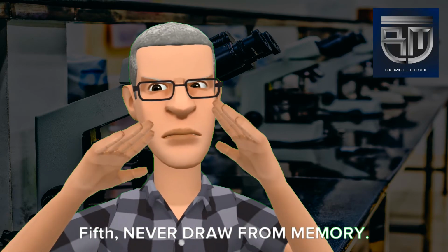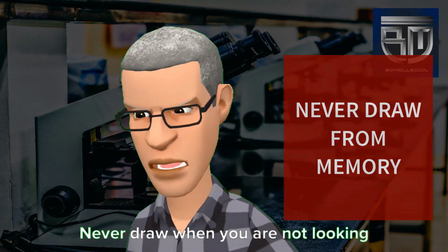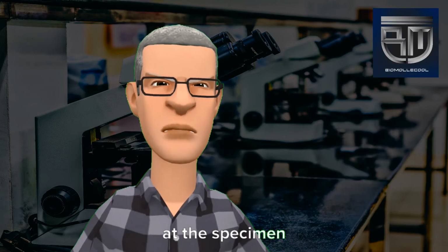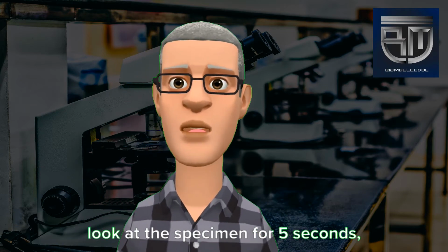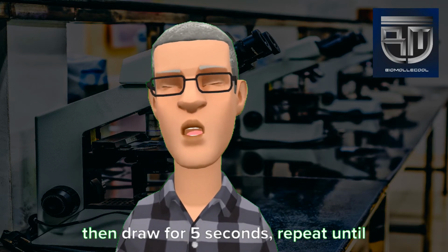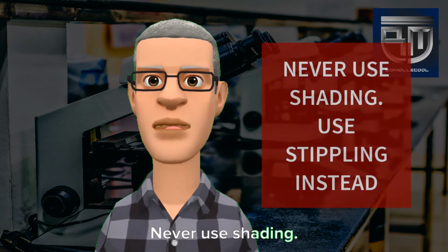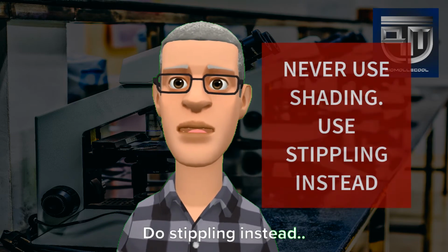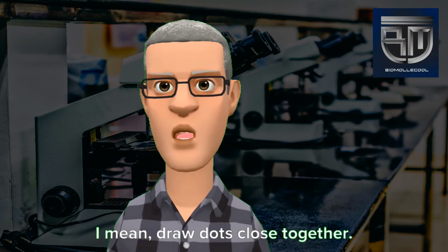Fifth, never draw from memory. Never draw when you are not looking at the specimen. Look at the specimen for 5 seconds, then draw for 5 seconds. Repeat until finished. Never use shading. Do stippling instead. Draw dots close together.